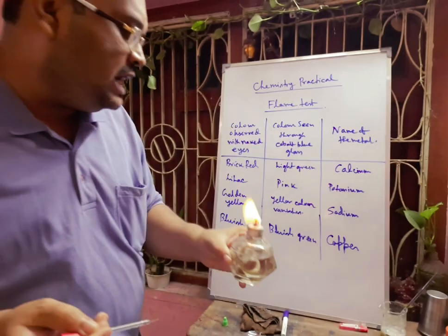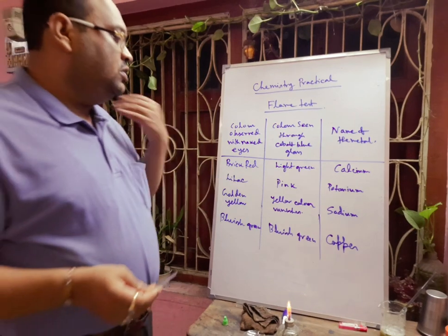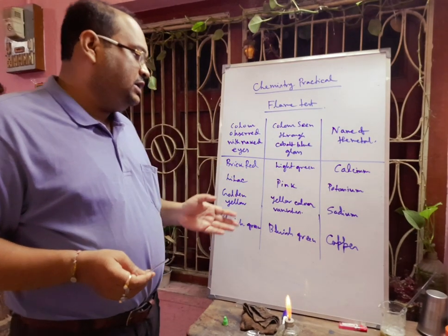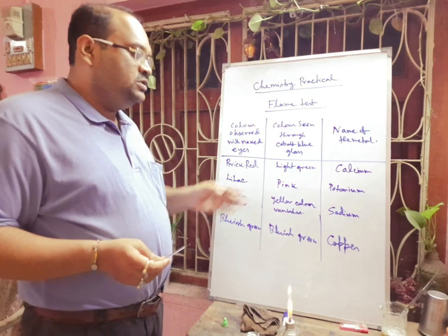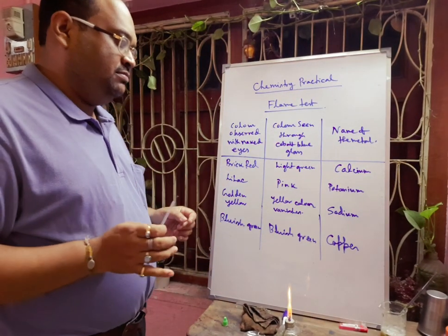By this test you can easily identify potassium. If you observe through double blue cobalt glass, you will observe a pink color. In this way you can easily identify the potassium ion.